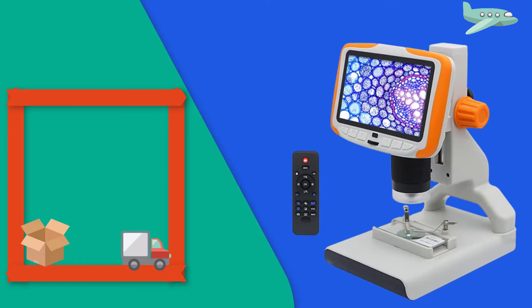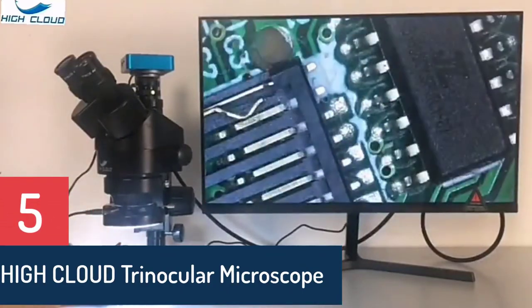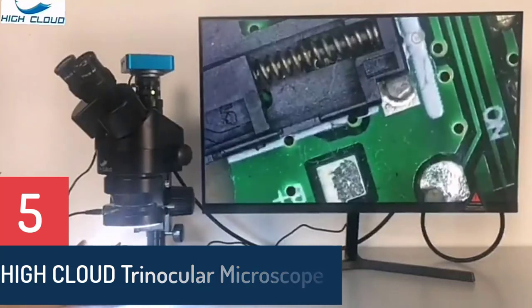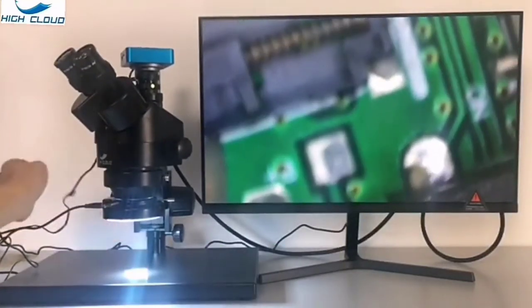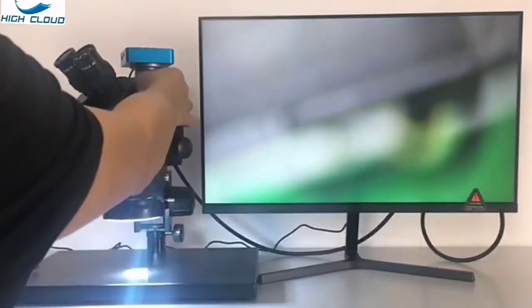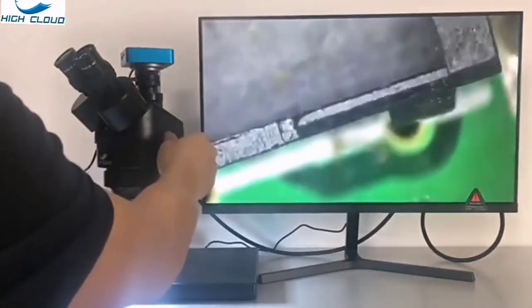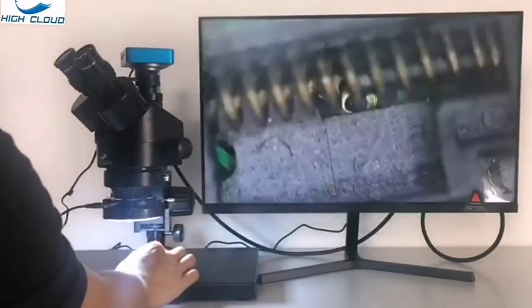Features: 7x–45x Continuous Zoom Magnification. 45-degree inclined trinocular simul-focal head with super wide field high eye point. Trinocular port for adding photo or video capability. 30mm super wide field WF10X eyepieces with 20mm field of view.